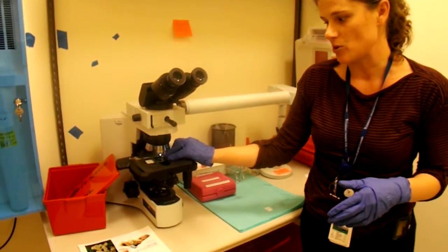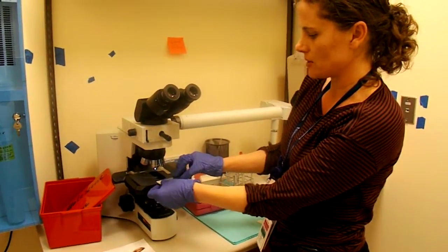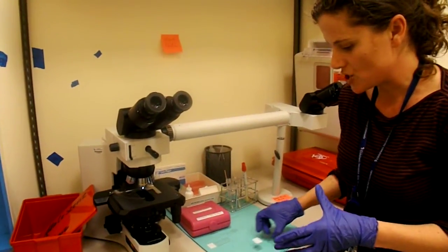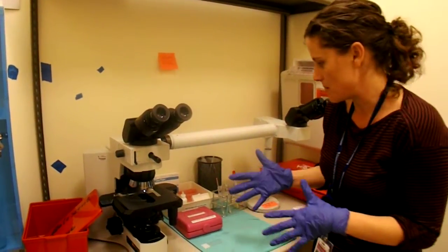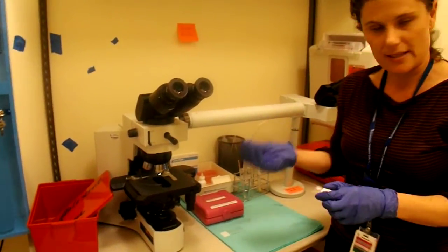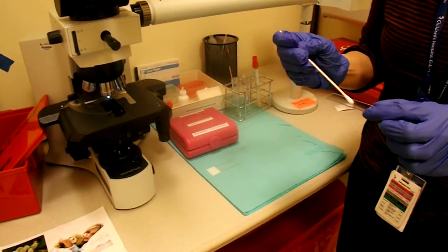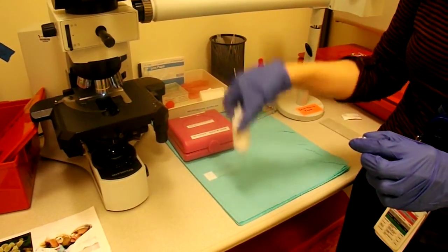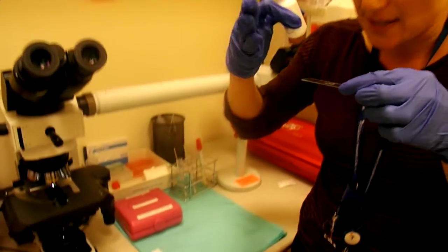You should be able to see almost everything on a saline slide, including yeast, although if there's a lot of cells or a lot of discharge, often you need a KOH to help you. The purpose of the KOH is that it blows out all the other cells and leaves the yeast, so it can make them easier to see. When you're doing your KOH, you'll use your own sample. You can use a sample with saline or without, it doesn't matter. Often you'll smear it on here, and then there's a KOH bottle here. It says 10% KOH, and you'll put 1 drop here, and you can do the whiff test.